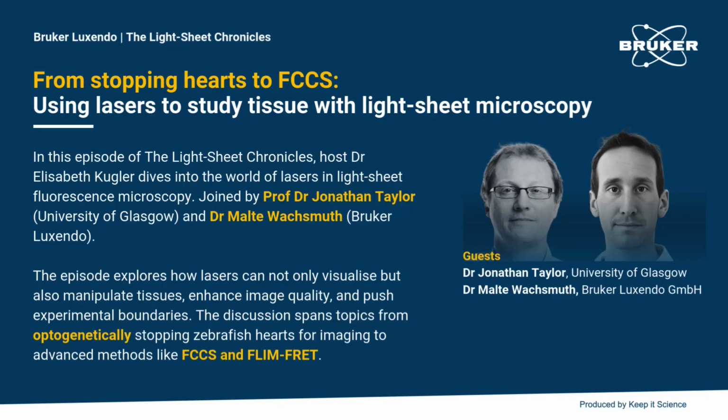Another way to solve this problem would be post-acquisition, by acquiring reference images where you can clearly see with a homogeneous sample, for example, of a dye in solution.